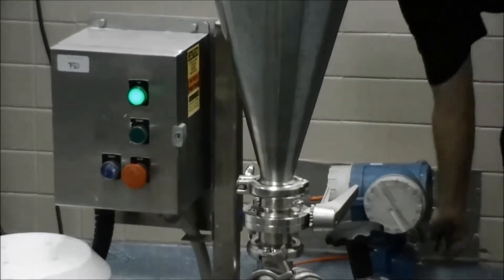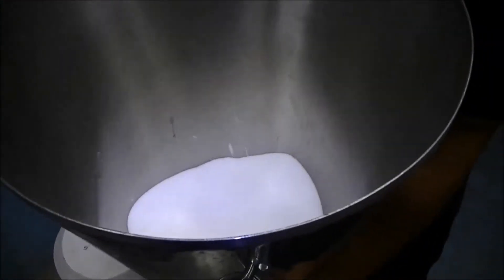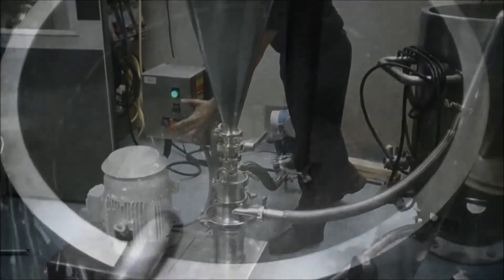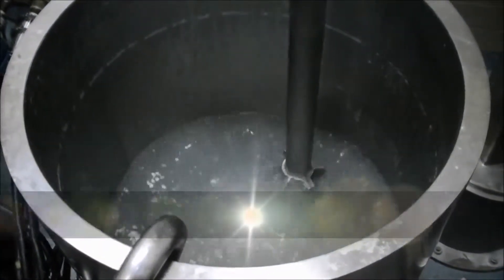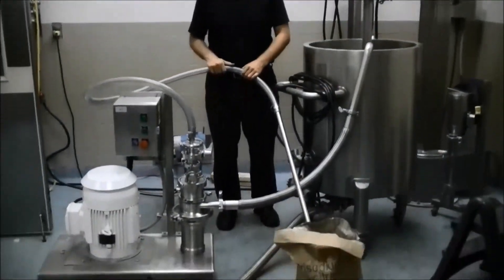We now have liquid flow. We still have our water flowing, and we'll feed our liquid flow through at 35 gallons per minute.